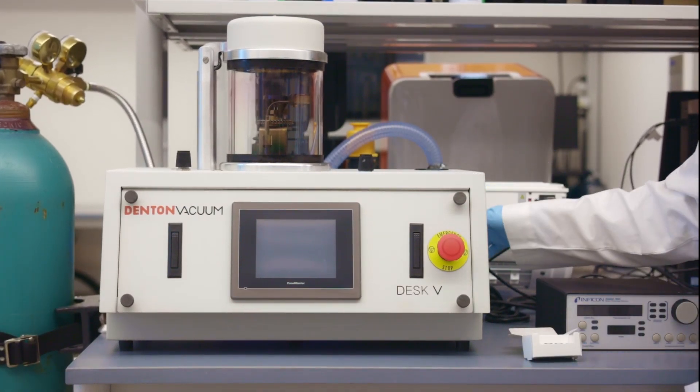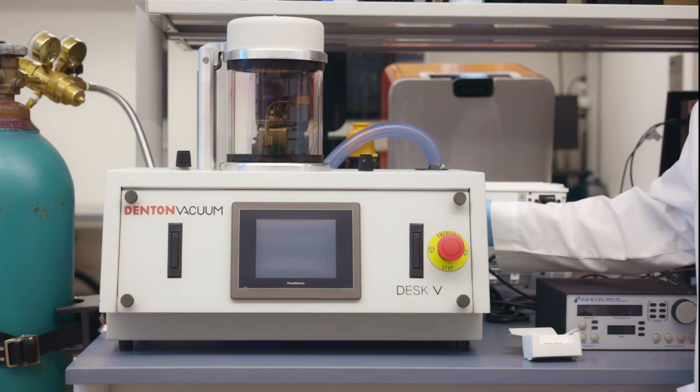Now power on the sputter coater by toggling the power switch on the back of the sputter coater.